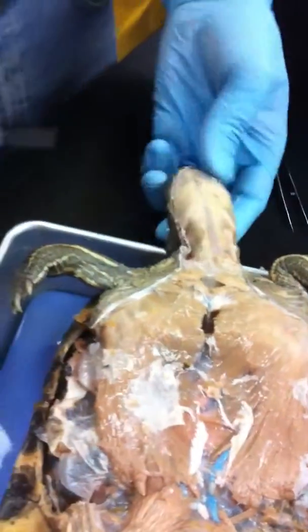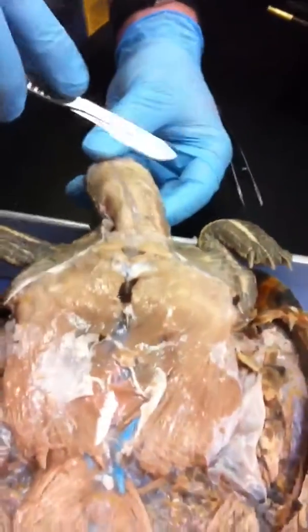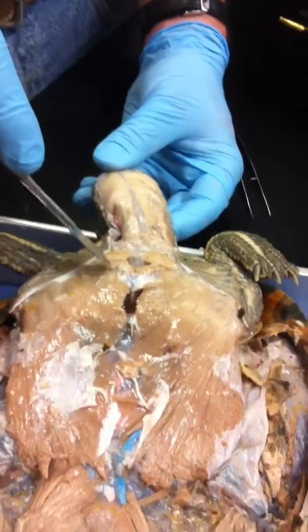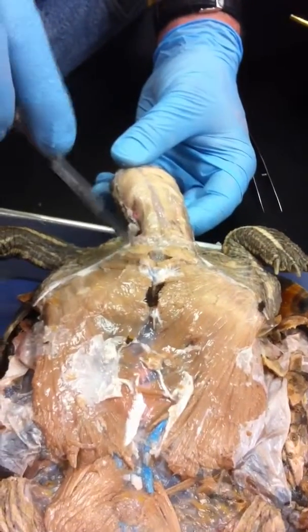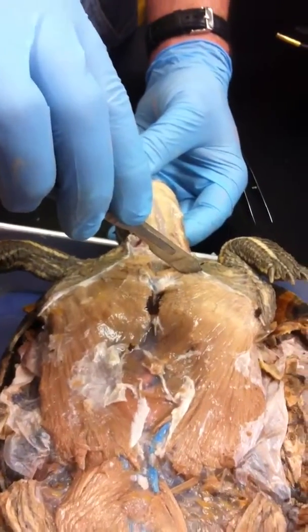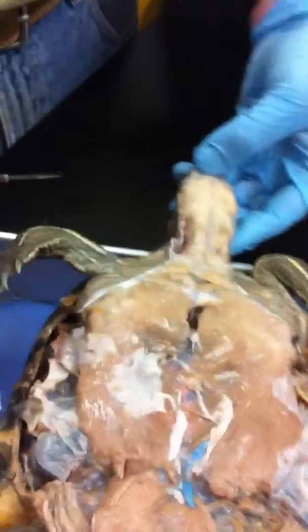Now both of these, on the left side of the turtle — they're attached to the head on the left side and they cross over to the sternum and pectoral girdle on the right. And the ones over here cross over and attach on the left. So they crisscross.